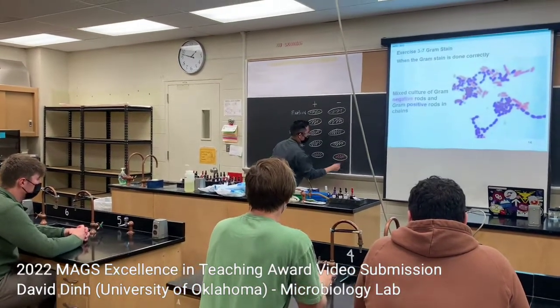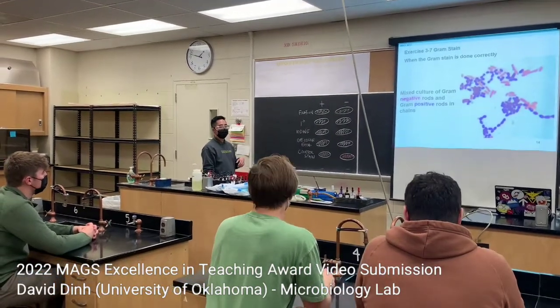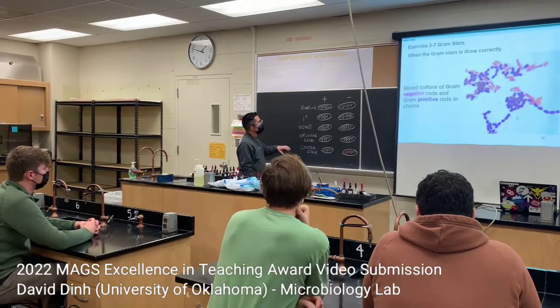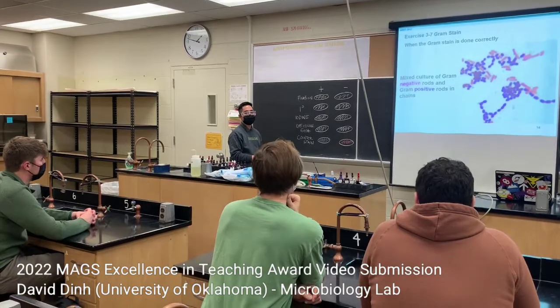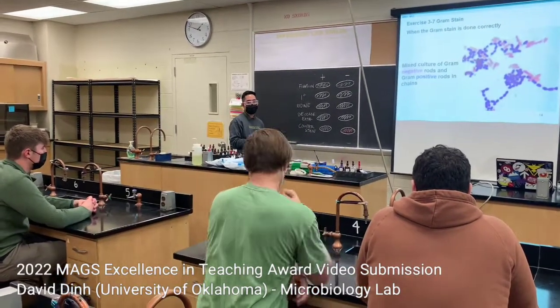So if you're confused about this, just contact me after class and we'll go over it again. But just note that for the exam, there could be variations of, let's say, someone accidentally removes one step, and what kind of color you get at the end. Cool. So then grab your Bunsen burner out of your drawers and that's it.